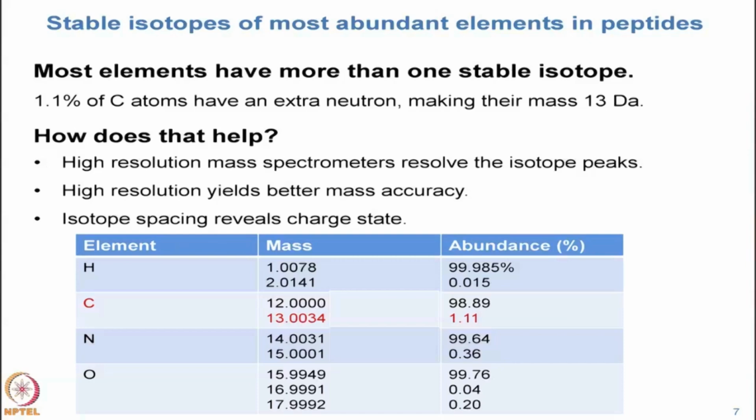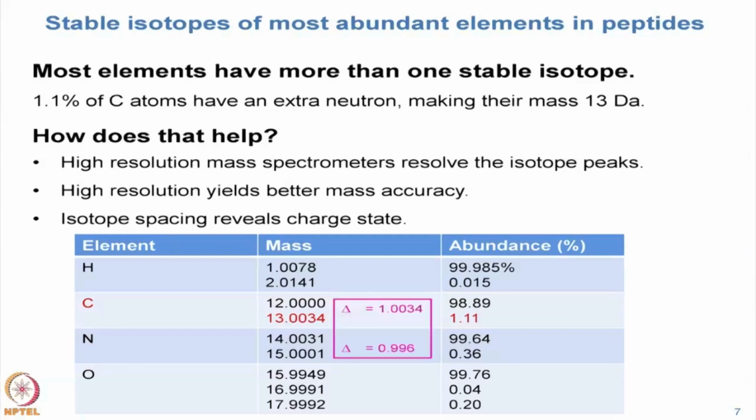It's crucial for doing quantitation these days for there to be the existence of carbon-13 and nitrogen-15. One other aspect that I want you to keep in mind is that the difference between carbon-12 and 13 is not the same as the difference between nitrogen-14 and nitrogen-15. That's going to be very valuable to us when we talk about multiplexing later.